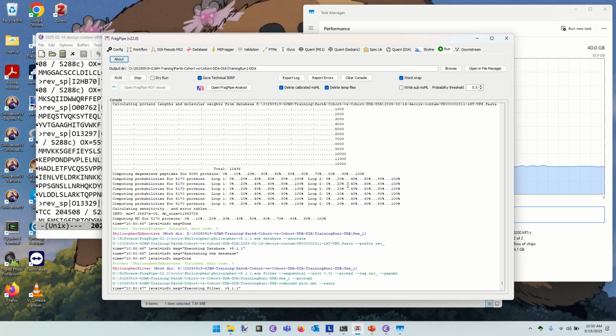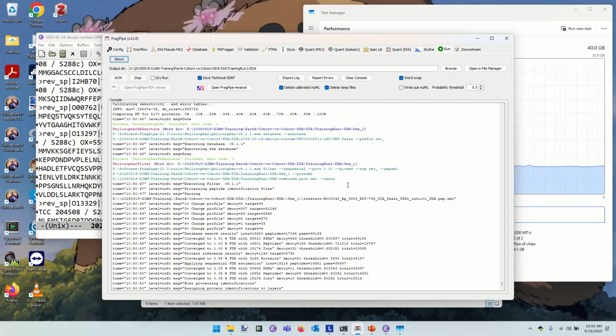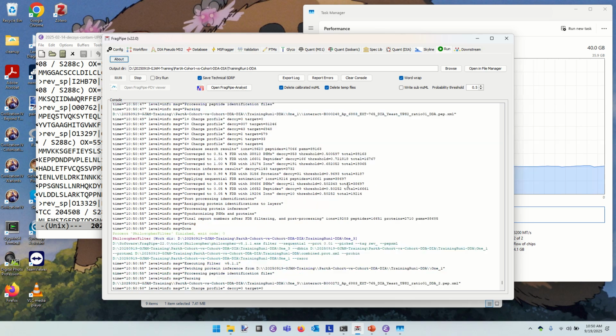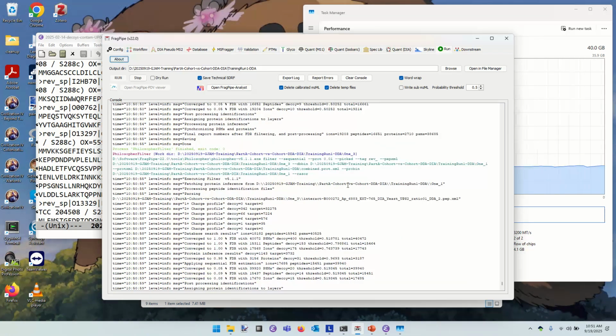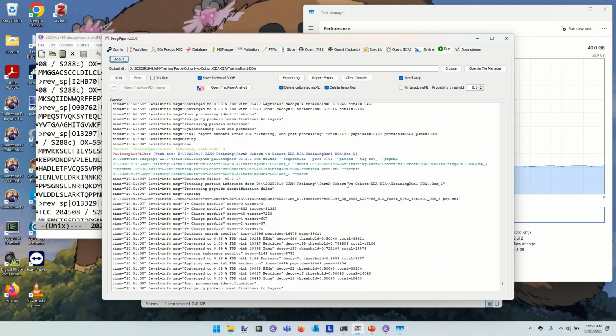But at some point, the software has to rise to a higher level and say, given this set of spectra that I think are confidently identified, which peptides can I say confidently exist in this sample? From that set of peptides, how can I infer a parsimonious set of proteins that explain the existence of those peptides in the sample?